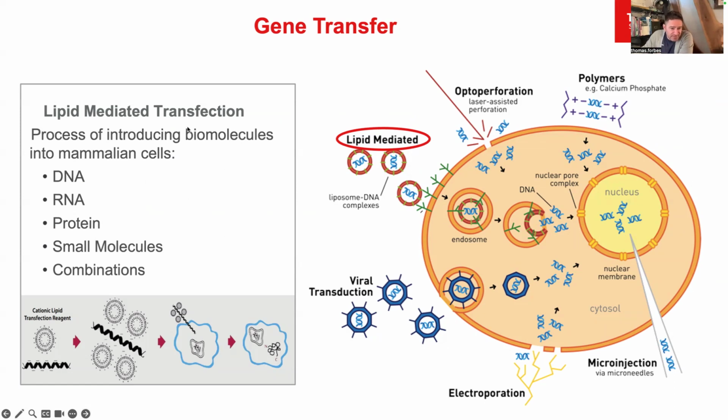So just quickly, we'll start with lipid-mediated transfection here. This is a technique in which we take advantage of the positive charge of lipid complexes to bridge with the net negative charge of the cell and DNA. That complex then enters the cell via endocytosis, as you see here. There are a couple of important considerations that impact lipid transfection, things like cell type, passaging number, health, density, the reagent amount and ratio to delivered molecules. But again, all food for thought when designing and implementing an experimental plan.